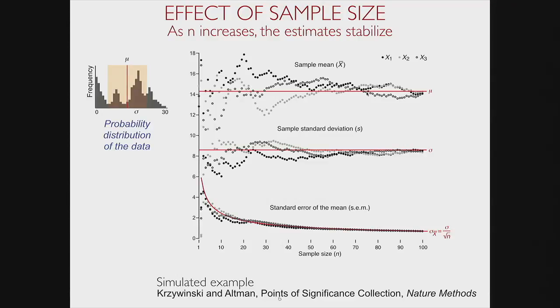But then when the sample size increases, the mean becomes very close to the underlying mean in the population. But this is what happens with the standard deviation: as the sample size is small, standard deviations tend to be smaller, which means that we are actually too optimistic. We underestimate the amount of variability in the data. And if we underestimate the variability, it means that we will be too optimistic. So we'll often mistake some noise for systematic signals, so we will end up making more false positive decisions than there should be.